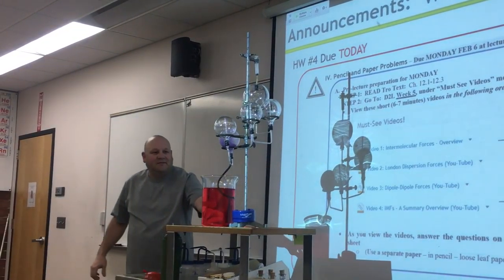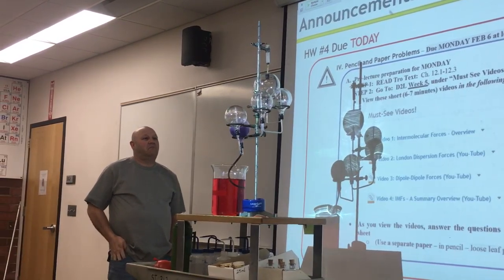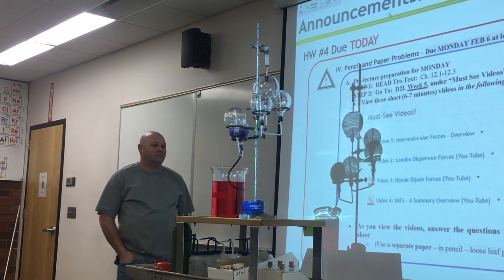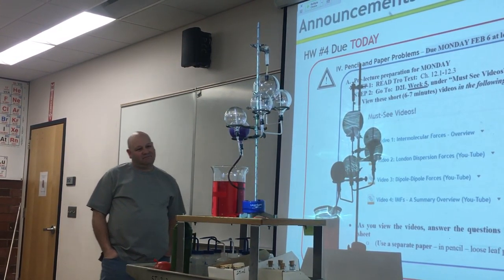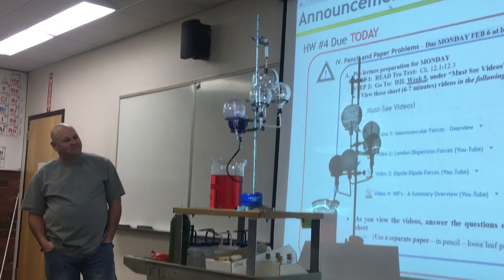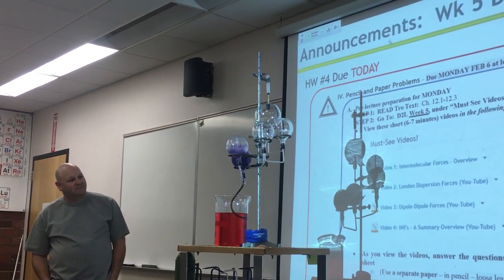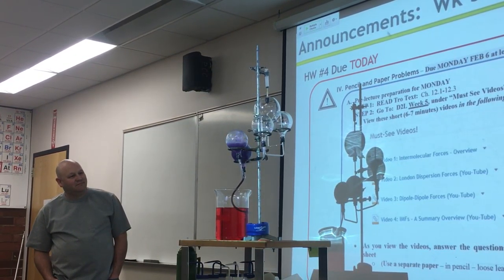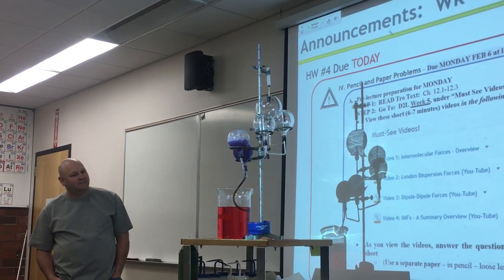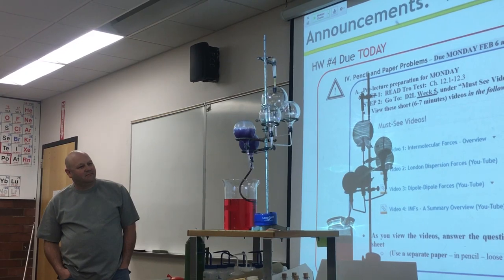This one's working. Now you have to think about what's going on. I hope it's not working. I think it's going to start — not working. I hope it makes it. Come on, baby. You can do it.